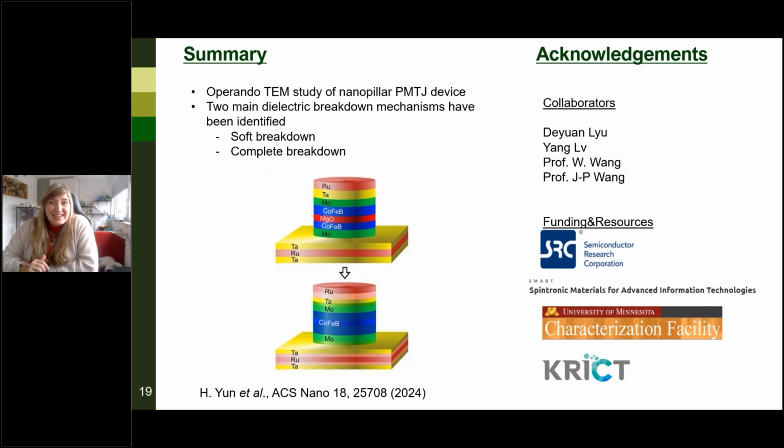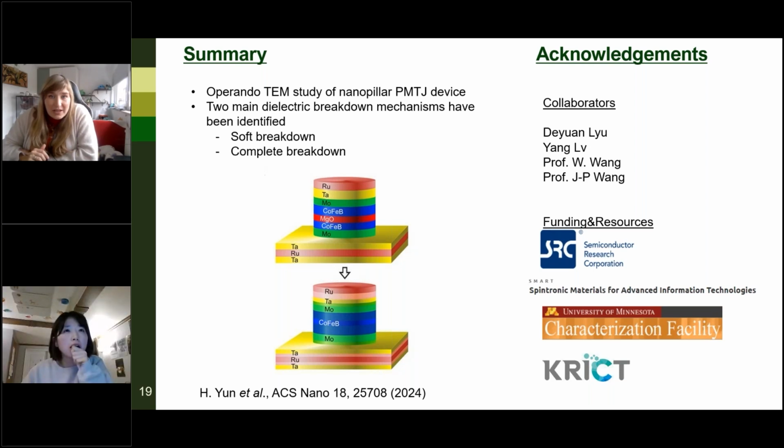Somebody is asking, if you use a Thermo Fisher STEM, they should have ADF1 and 2 detectors, which collect the differential scattering angle signals to form HAADF and LAADF. Would that be useful to enhance the contrast of the magnesium oxide layer?